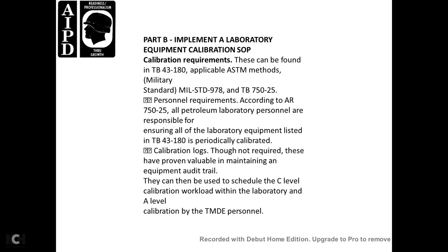Calibration logs are not required. However, they have been valuable in maintaining an equipment audit trail. They can also be used to schedule the C-level calibration workload with the laboratory and the A-level calibration of the TMDE.